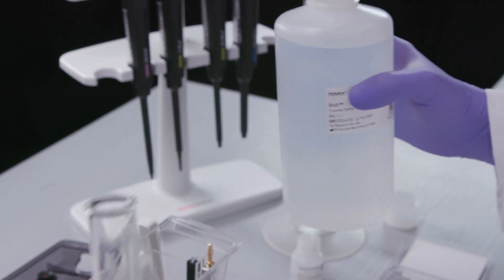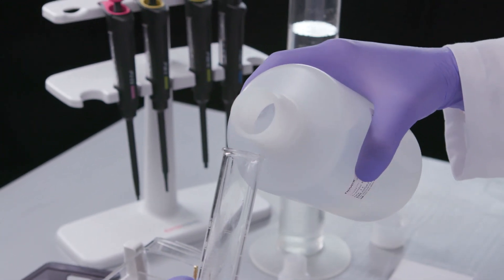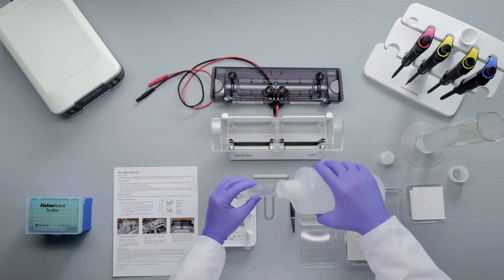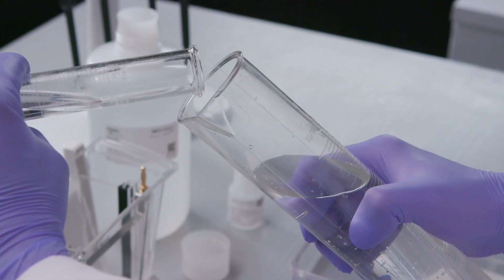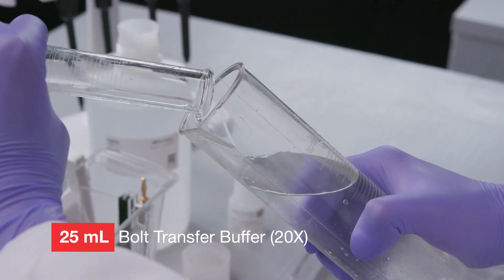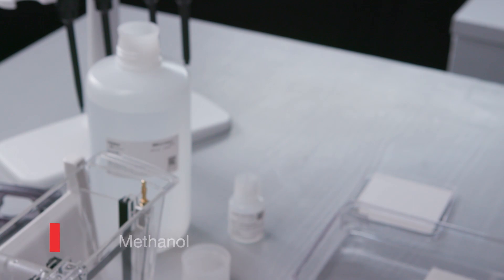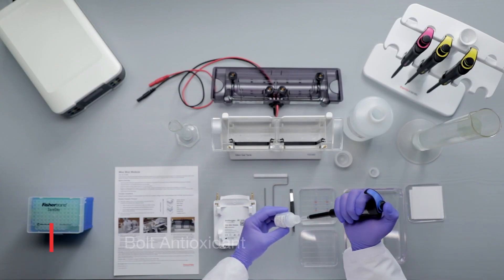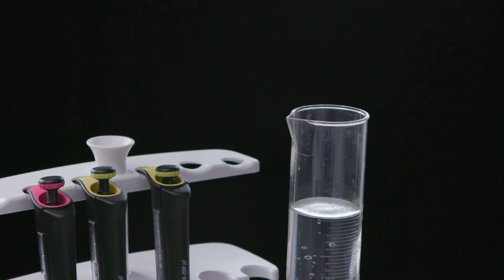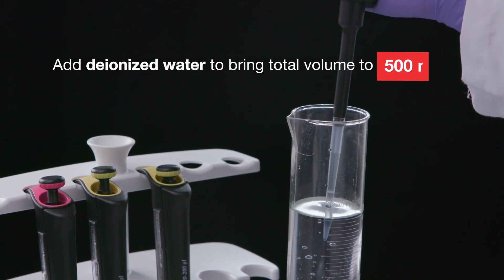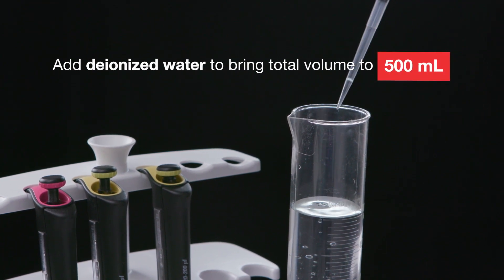Approximately 250 milliliters of transfer buffer is required for each transfer. Prepare transfer buffer by adding 25 milliliters of 20X bolt transfer buffer, 50 milliliters of methanol, 500 microliters of bolt antioxidant, and bring the total volume up to 500 milliliters with deionized water.